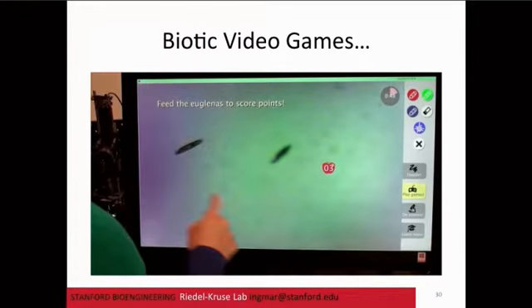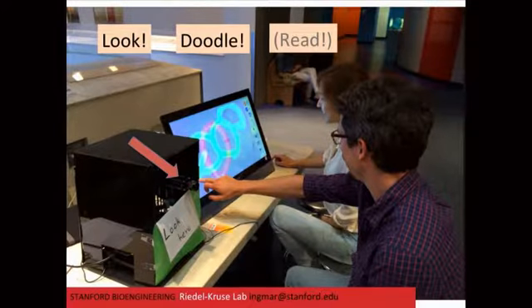We then tested this system multiple times in the San Jose Tech Museum. The setup is essentially this big touch screen, and next to it the setup, which we made semi-open so people could look inside, and also the eyepiece. People came, and we just watched from a distance what they would do. I want to walk you through a few examples.